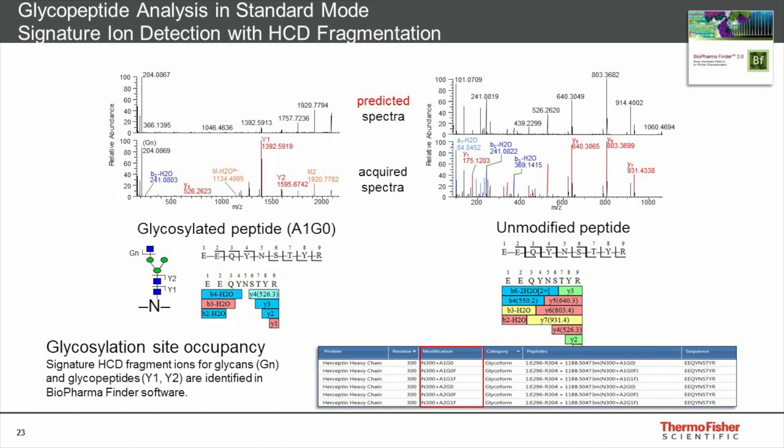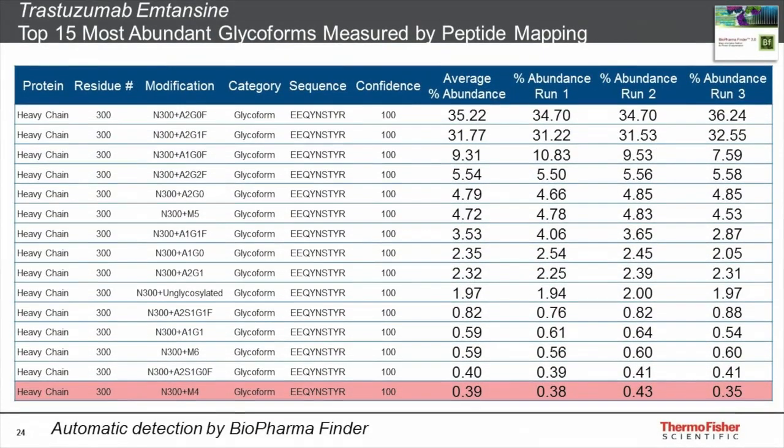At the end, this delivers a chart which is talking about, in a site-specific manner, all of the peptides which correspond to a modification at that site. And this is really, for a peptide mapping approach, the kind of information that you want, where we want to eventually be able to say, you know, what's the abundance of this form, this specific kind of modification, given the fact that there's this diversity of other forms as well.